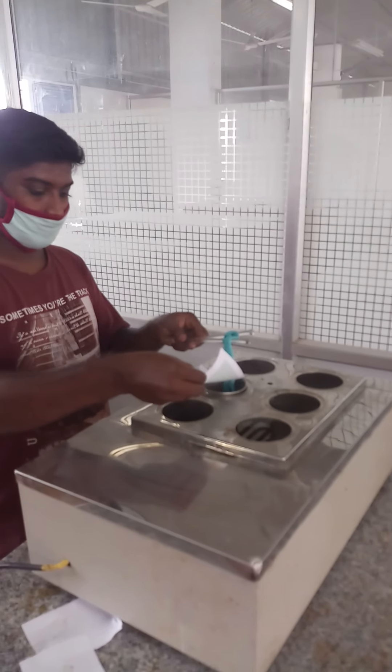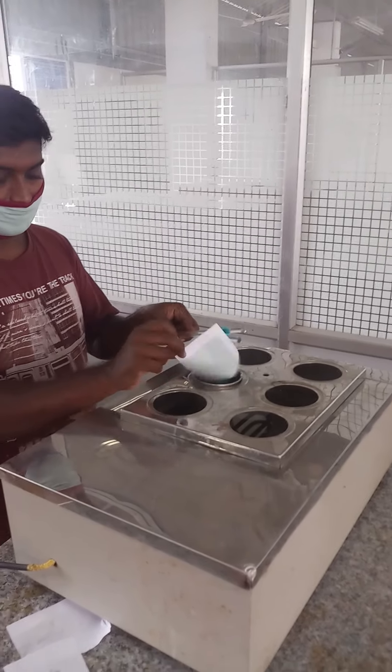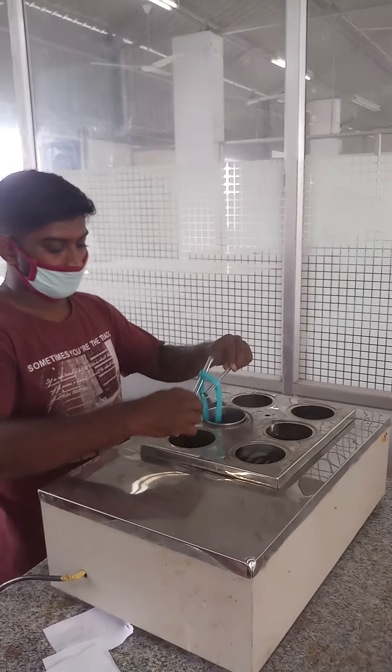Now the remaining amount of sodium chloride and sodium hydroxide is to be added to the dye bath, and dyeing should be carried out for another 45 minutes.